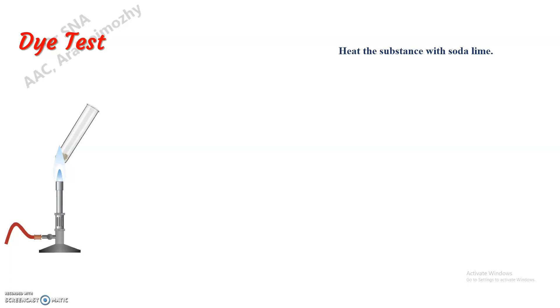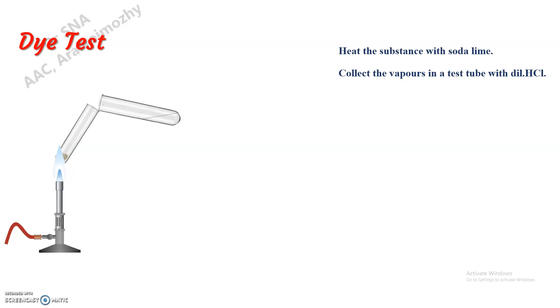Now we have to collect this primary amine fragment in another test tube having dilute hydrochloric acid. So collect the vapors in this test tube.